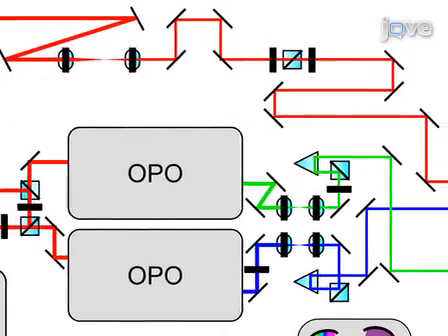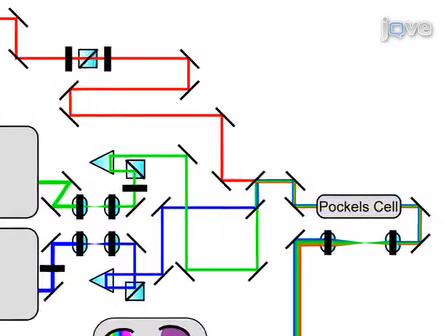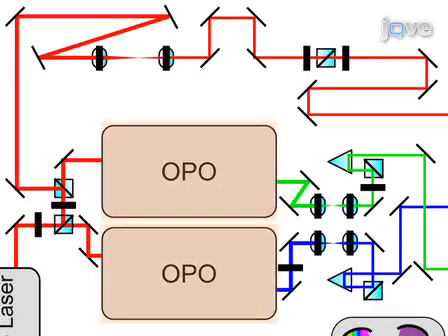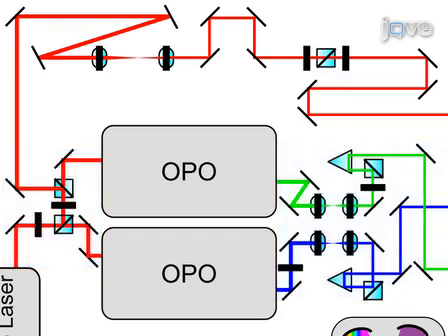In order to efficiently produce coherent Raman signal photons, the recombined pulses must be overlapped both temporally and spatially. Because OPOs contain ring cavities allowing each laser pulse to pass through the crystal multiple times, the beams sent through the OPOs travel an extra distance, resulting in considerable delay relative to the original pump beam. This distance must be compensated for with the third beam by introducing extra mirrors that force this beam to travel the same distance as the other two before they are recombined using dichroic mirrors.